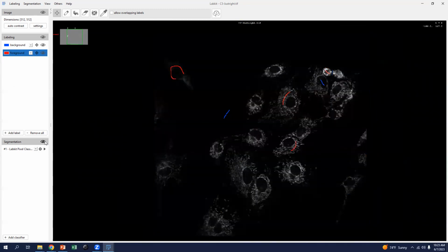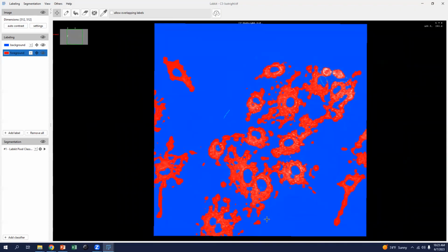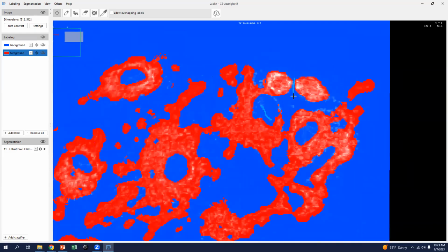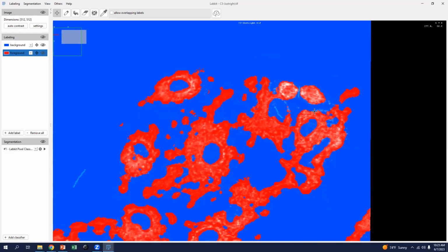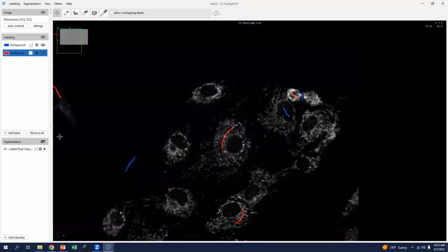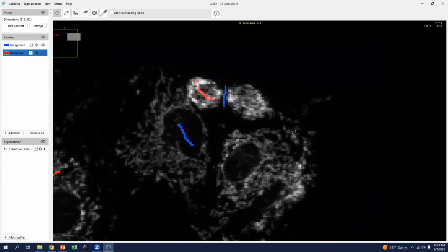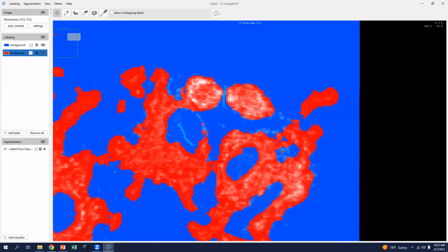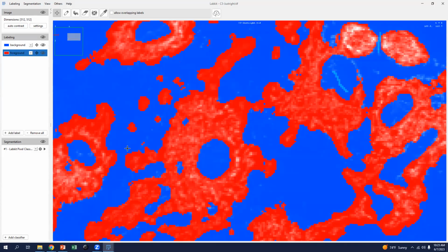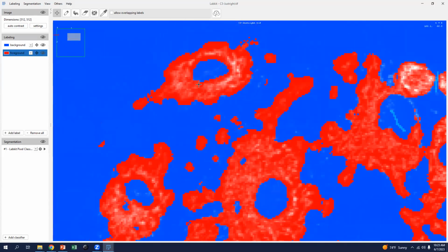So we had a first labeling set. We've labeled it a second time. We see the second has removed the connection here, removed the connection here as well. It's counting this. It's not counting this. It's not counting the center, which is good because we explicitly don't want it to count that.